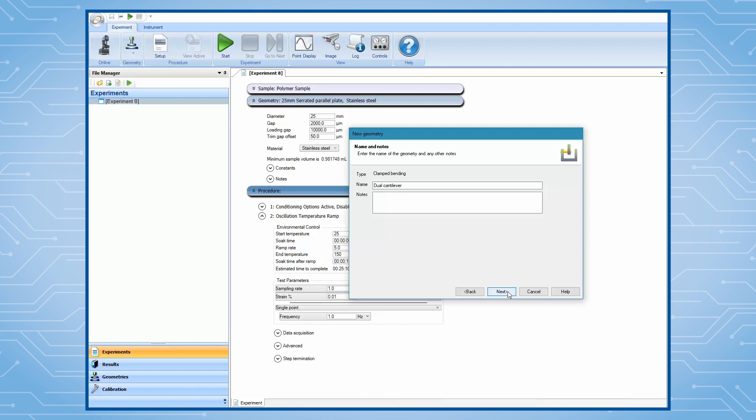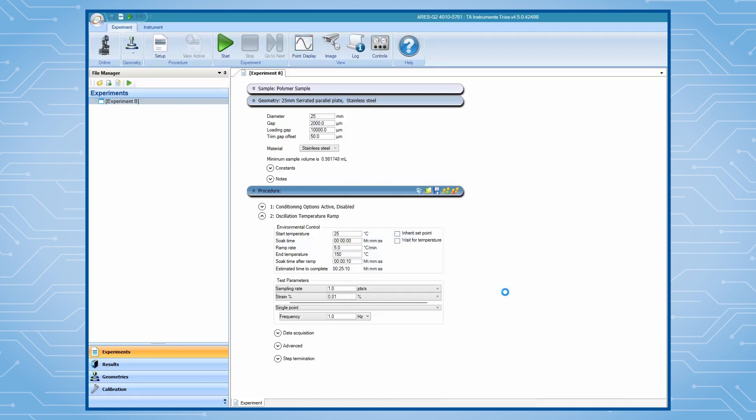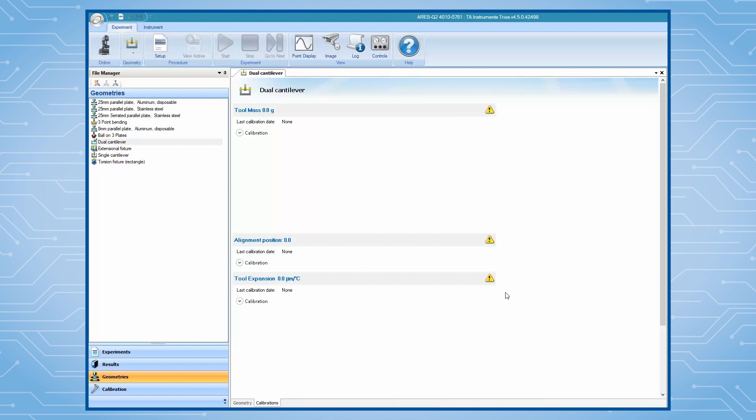At the end, click on Finish to create this geometry file. Then TRIOS will automatically lead you to proceed for the clamp calibration.